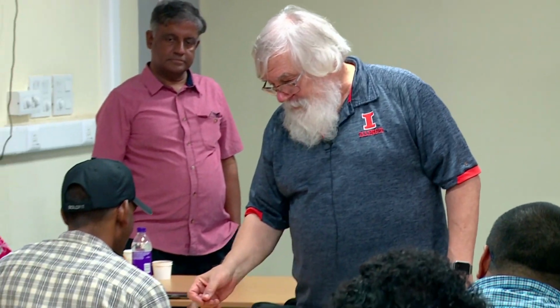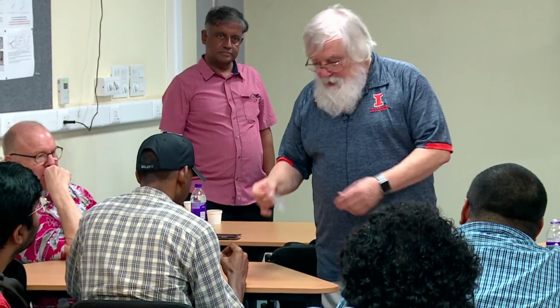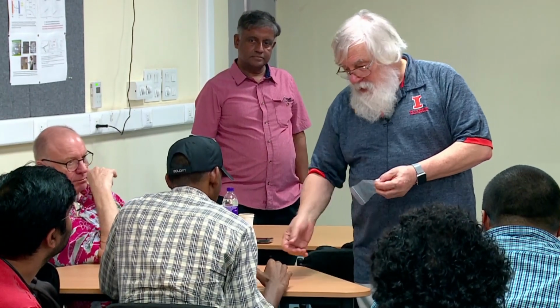Now, the challenge with his samples is that you're going to want to do a cross-section through this, right? So, can we write on the board? We have a writer? Yeah, hang on. Writing utility. Here we go.